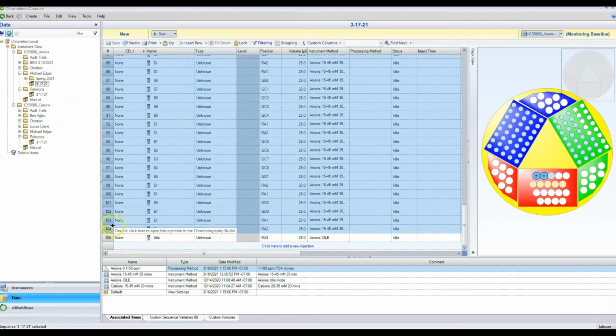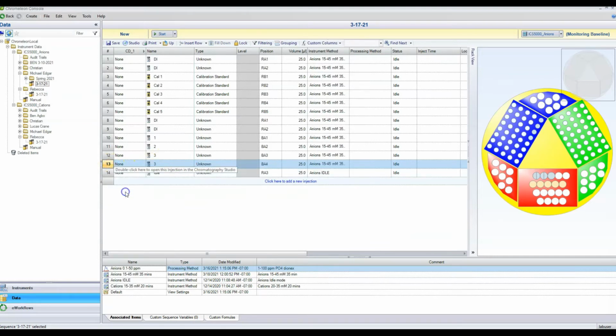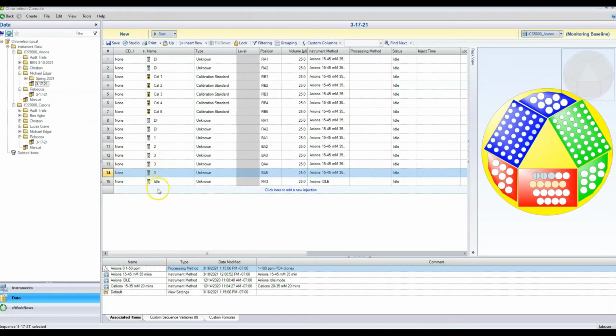Now, I do want to keep my idle mode. Every run that you make should end in idle, and it should actually end in 2 DI waters. So I'm going to show you how to insert samples. If you just right click and you hit insert, a sample appears. Right click again, a sample appears. If you need to load a lot of samples, now these are going to be DI waters, so I can just change the name. If you need to load a lot of samples at once, I like to do it 5 at a time.